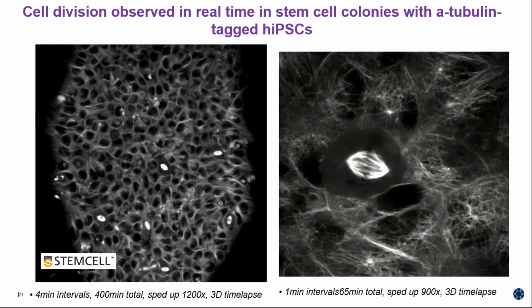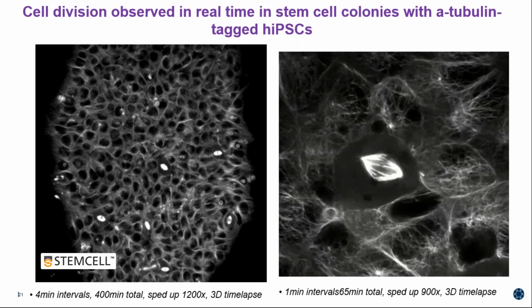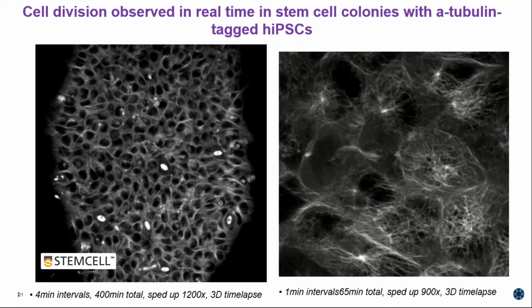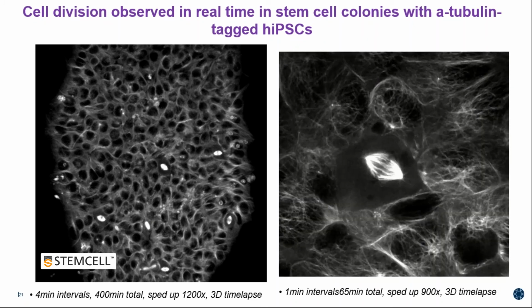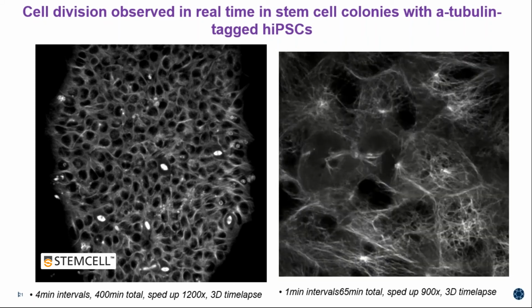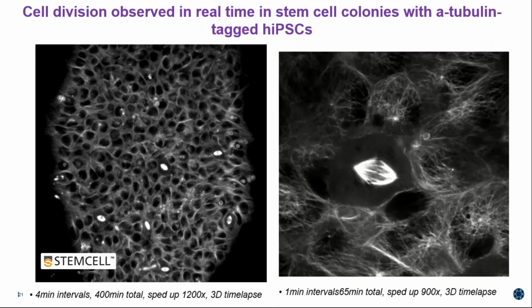And this is a higher magnification time-lapse movie. And you can almost see the individual microtubules, and you can see that cell division. Again, not super resolution microscopy here. It is just very clean because there's no background, and it's endogenous expression.